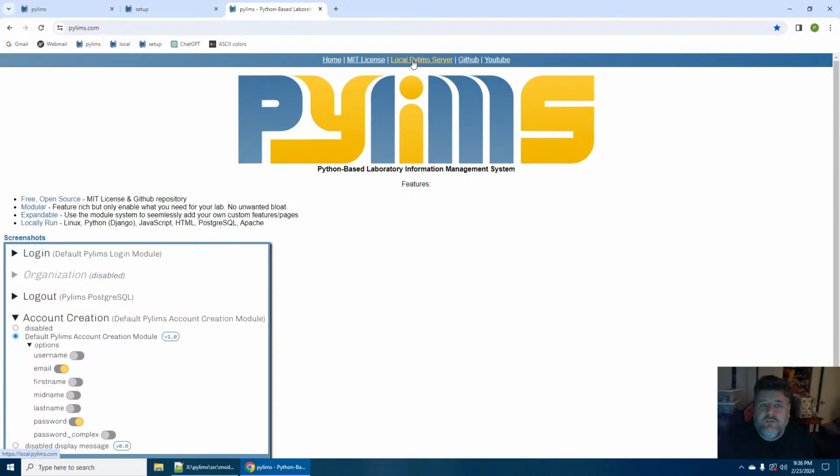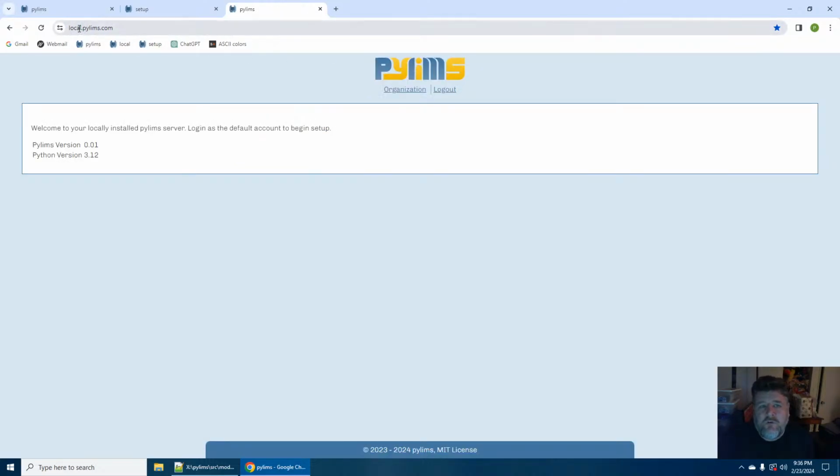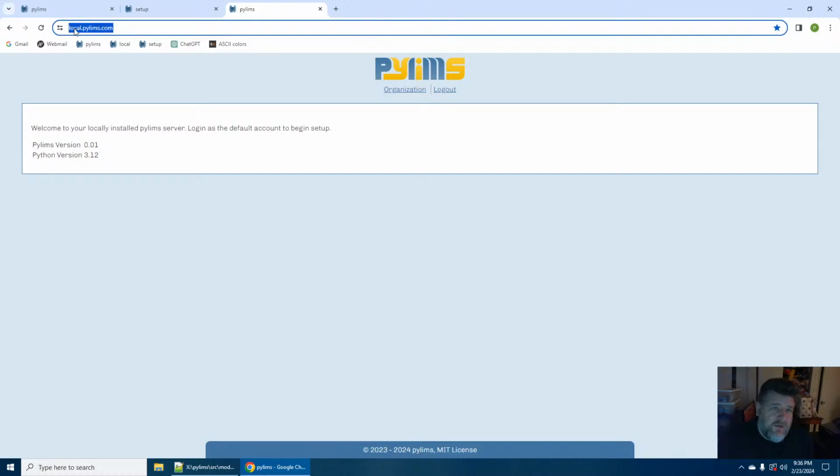So when you click this, it opens up this URL, local.pylims.com. The only thing that this does is point to your own local server. I can explain more about that later, but this is running on a machine in my house. If you click this link, it'll probably go to nothing because you don't have a server set up. It'll just error out. It'll say can't reach, like when a web page doesn't work, because all it's doing is looking on my own network for an IP address.